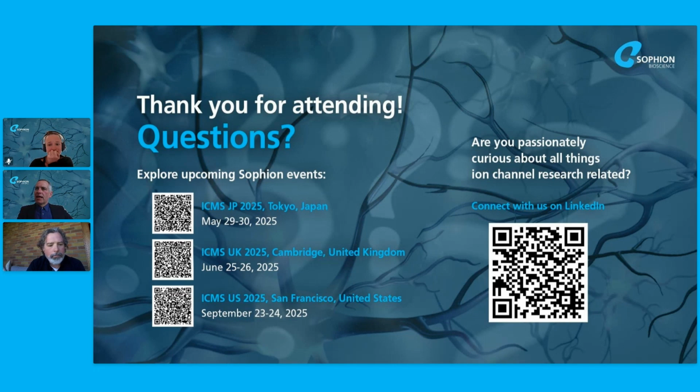And then Alison asks, how long can you culture or compound treat neurons on a chip before analysis, or are they plated immediately before patching and you'll lose most projections in the dissociation and seeding? And again, obviously that could be in terms of the APC characterization, but I guess Scott could even potentially answer some of that around where they're not dissociated in MEA recordings. But maybe you start first, Kadla.